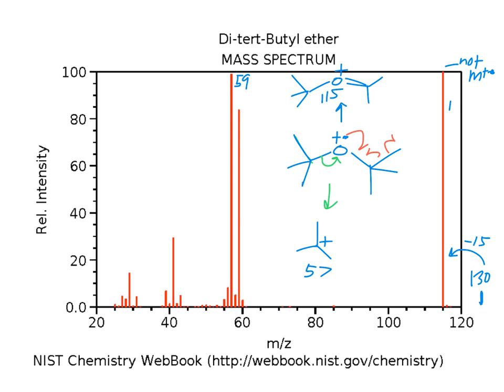This is at 115. So I'm not exactly sure, again, how that 59 comes up. So it would have to do something else. But at least we got the two biggest peaks this time. No, that was 57. Sorry. I said 57 and wrote 59.